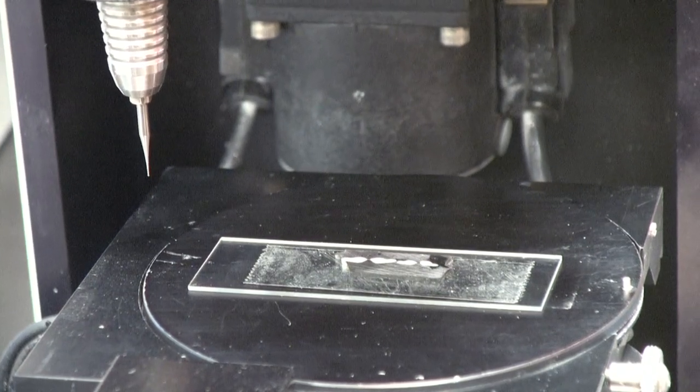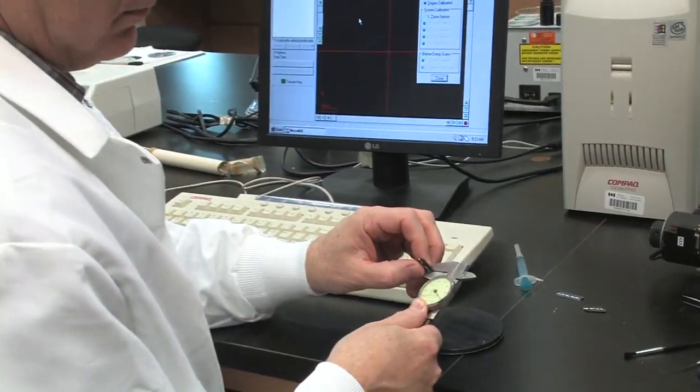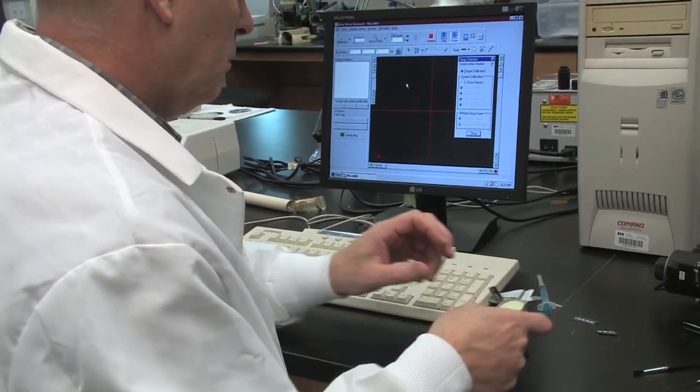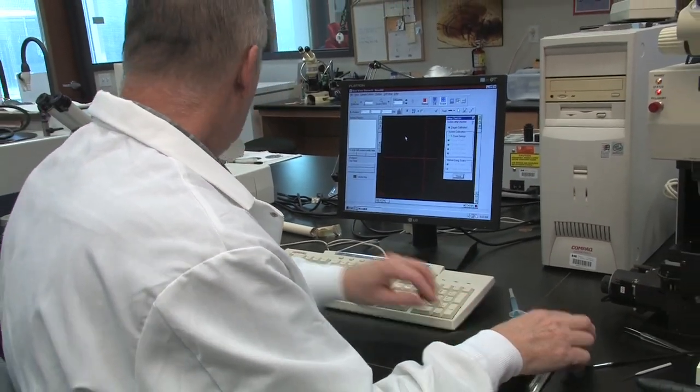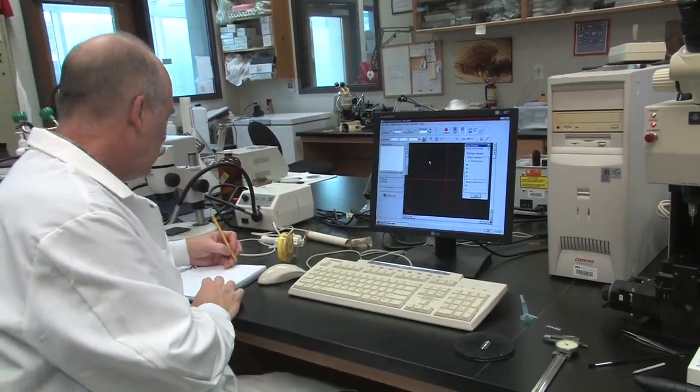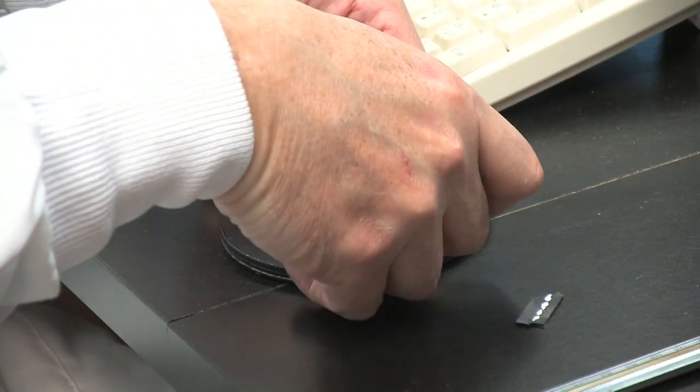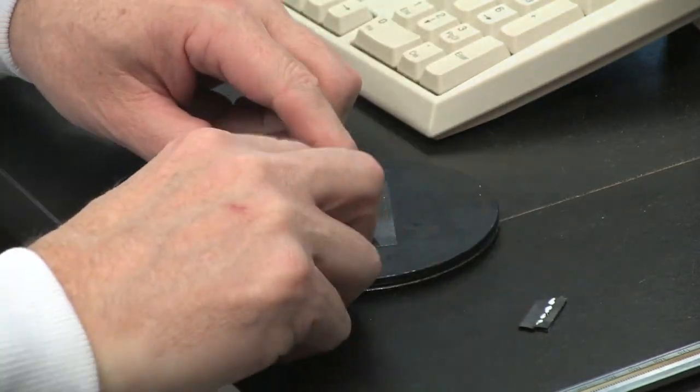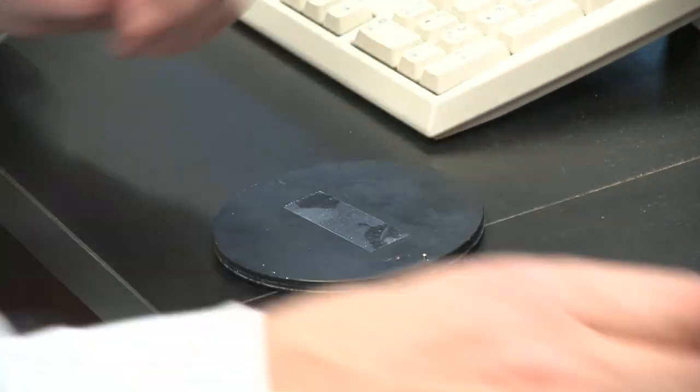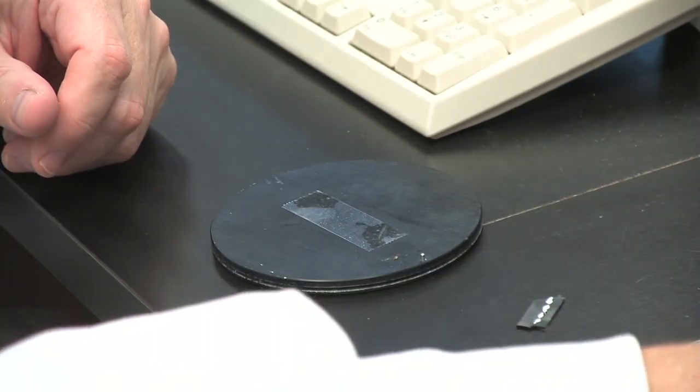At this point, you should attach your sample to the sample plate. Measure the thickness of your sample with a micrometer and record. Set up your sample on one of the black circular stage plates from the micromill. Use two-sided tape to secure a glass slide to the stage plate.